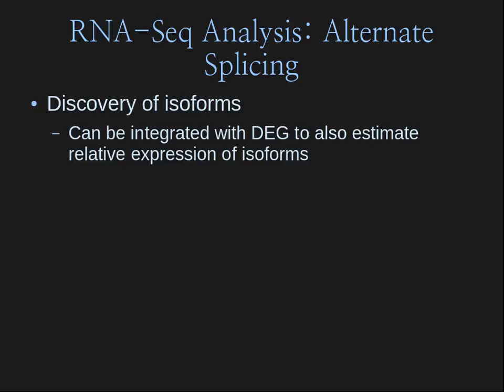What's going to happen is if you do really low coverage, then you're going to get some reads here, read here, read here, and so on. Same thing with this. So we're going to get all these different reads from different fragments here.